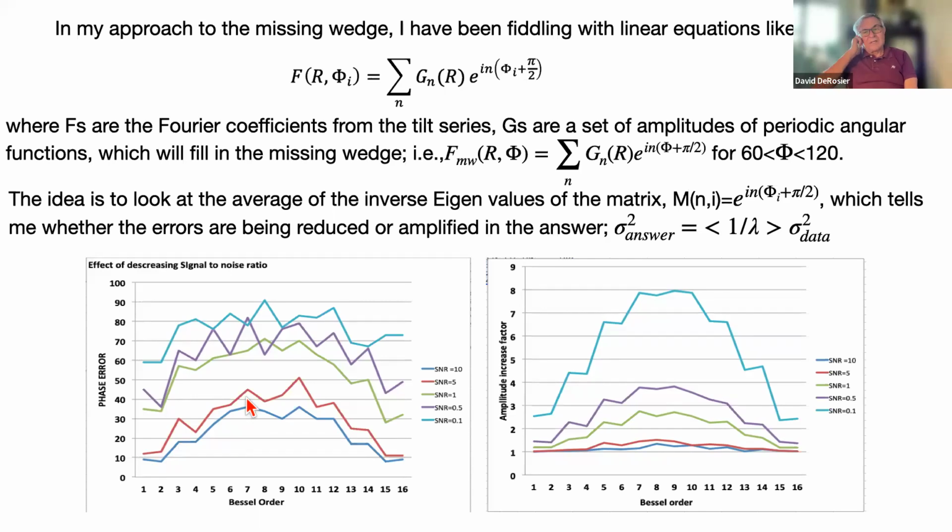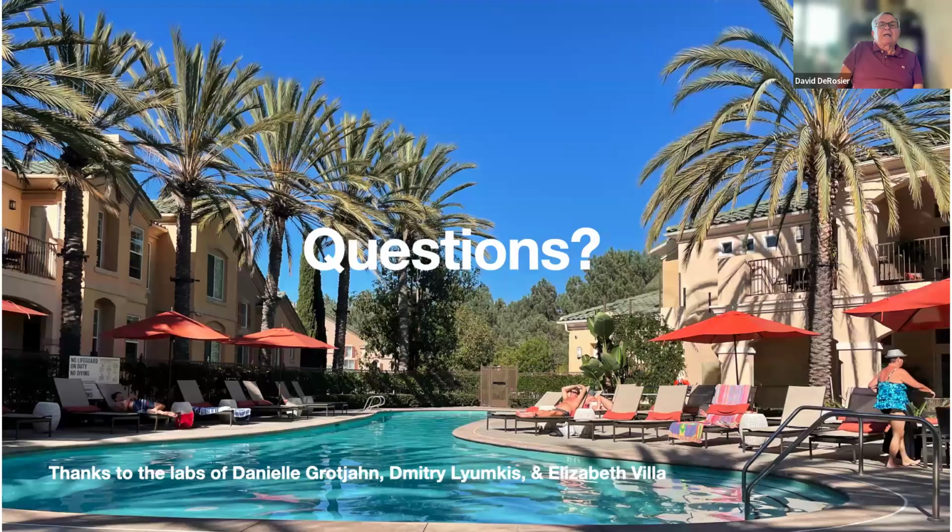So the only way to improve this, in my view, is to go into real space, where you can enforce things such as the thickness of the lamella. Anyway, I leave you with a view of where I will spend my afternoon today, and ask if you have questions. Thank you.